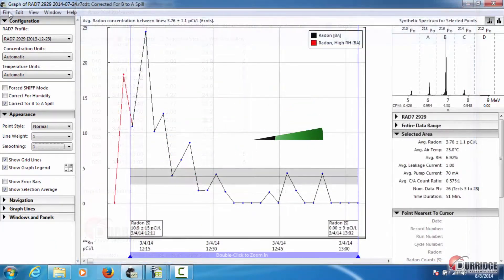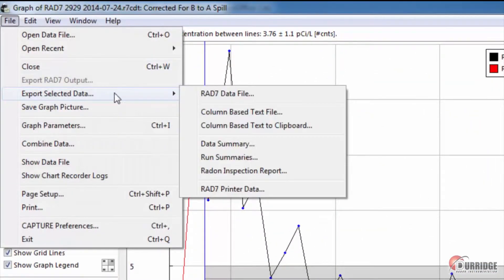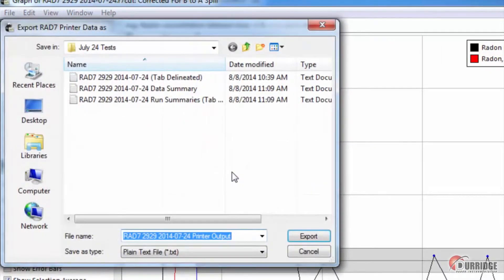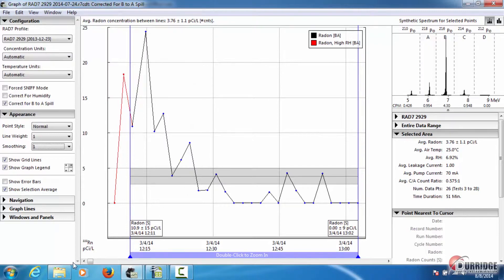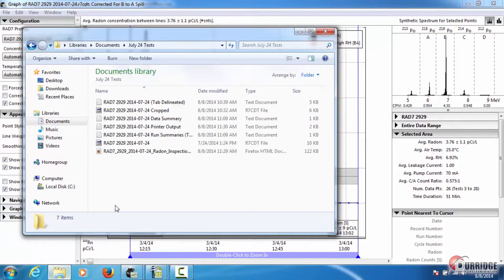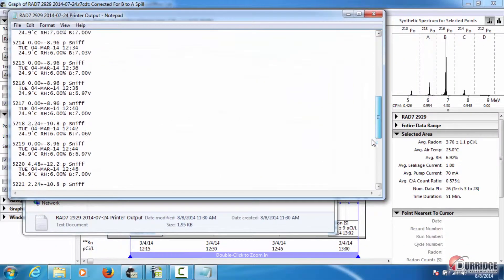Exporting as RAD7 printer data saves the data as a text file that looks the same as the printer copy from the portable thermal printer that comes with the RAD7. If you select this option, just pick a location and name to save the file. If you open the file in Notepad, you can see that it looks the same as the printer output.